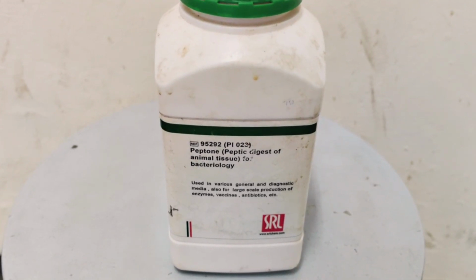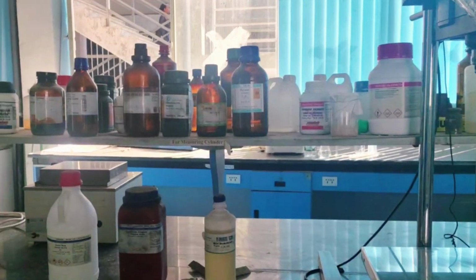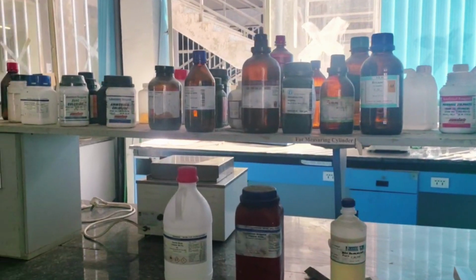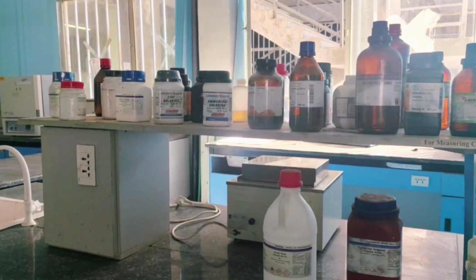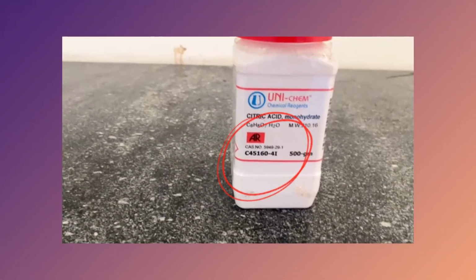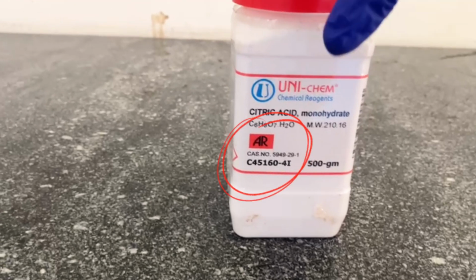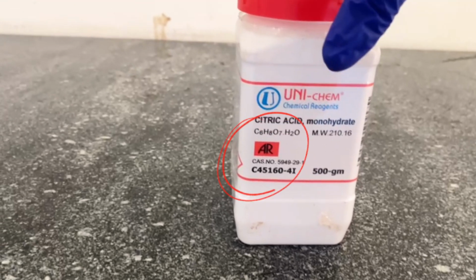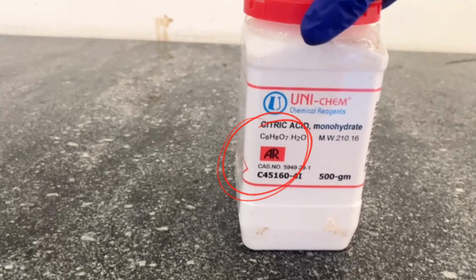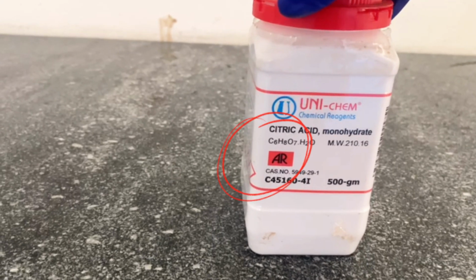research and experimentation. So, you might have seen labels like AR, CP, ACS, and RE on some of these chemicals. Let me break down what each of these labels means. AR, or analytical reagent, indicates that the chemical is of high purity, making it suitable for analytical work and precise experiments. These chemicals are free from impurities that could interfere with lab analyses.